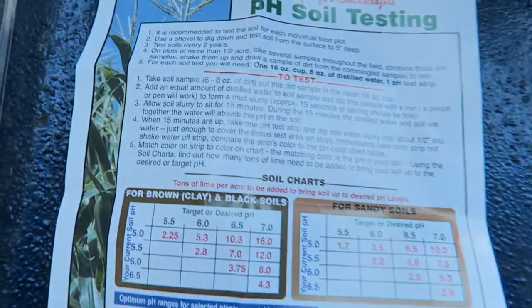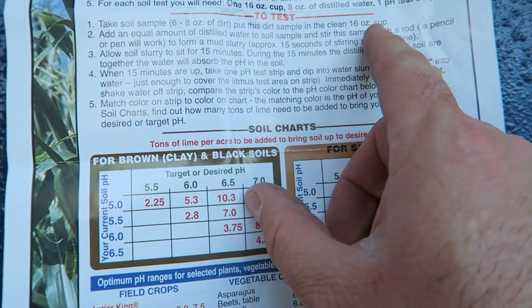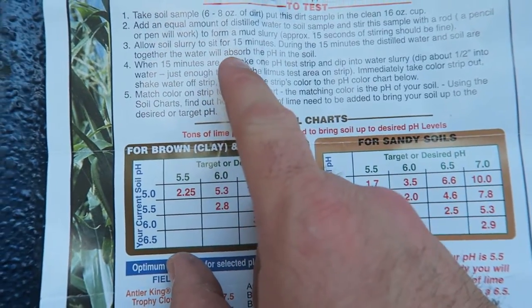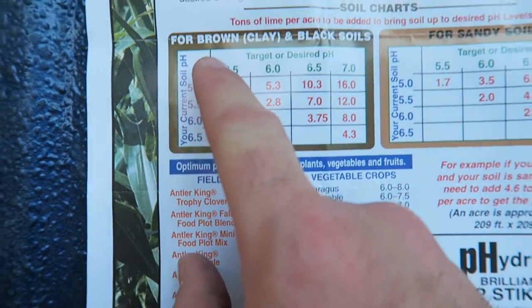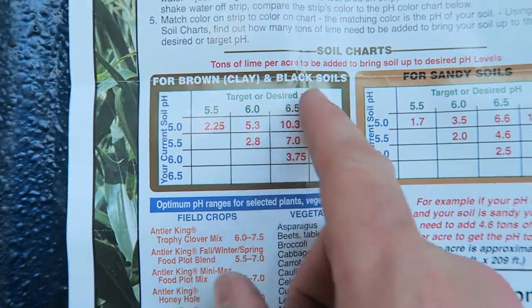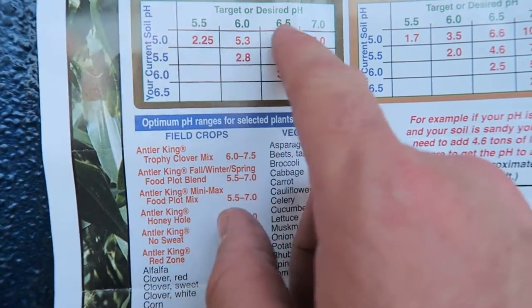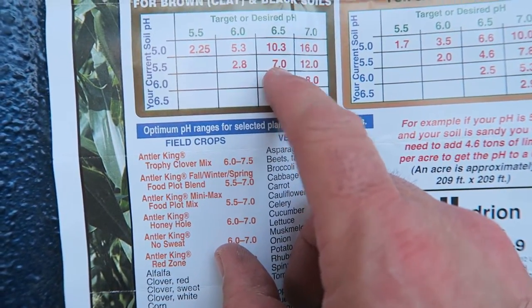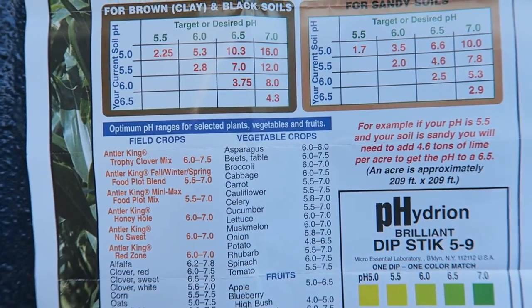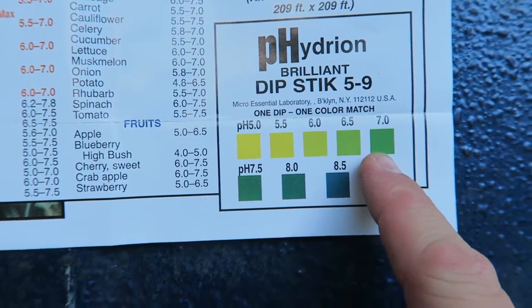Here are the test strips — it says results in 20 minutes, do it yourself, comes with four test strips and directions. It calls for six to eight ounces of dirt, put the dirt sample in a clean 16-ounce cup, use distilled water, let it sit for 15 minutes, mix it up, then dip the strip in. It also has a chart for brown clay or black soils and sandy soils — a lime calculation table showing your current pH, your target pH, and how many tons of lime you need to add. The scale goes from 5.0 to 9.0, and we're looking for something in the greenish range.